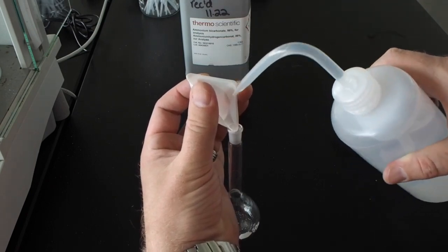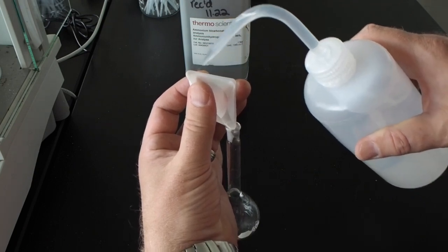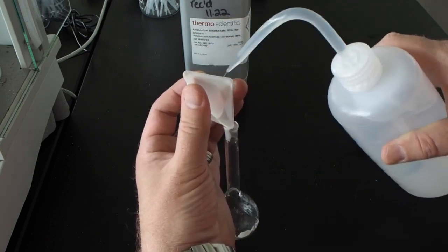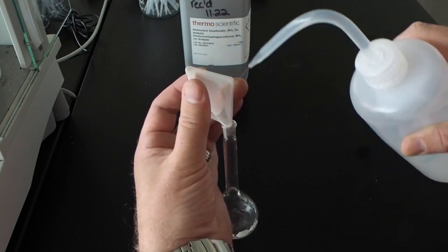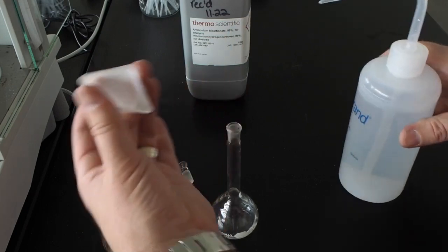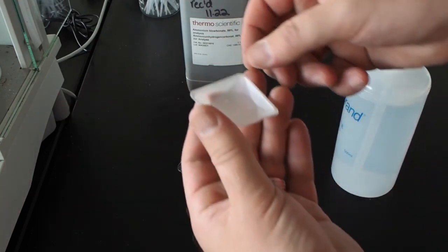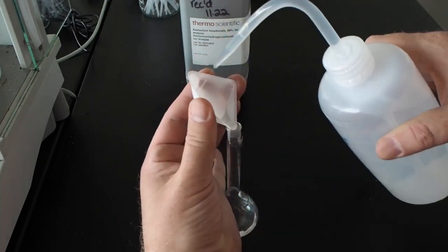What I need to do is make sure it all gets into my volumetric flask. To do that, I'm using the solvent that I'm dissolving the material in, deionized water, to wash every tiny little crystal off of this boat and down into the vol flask. I'm going to turn this so that I get the other corners as well.